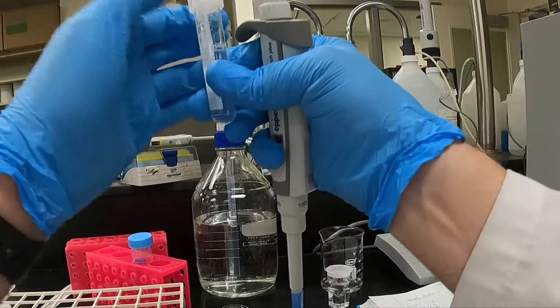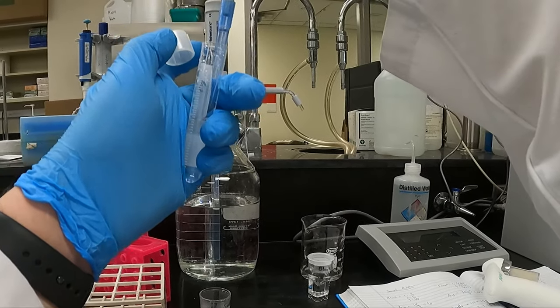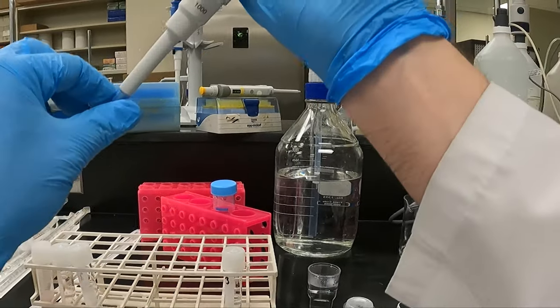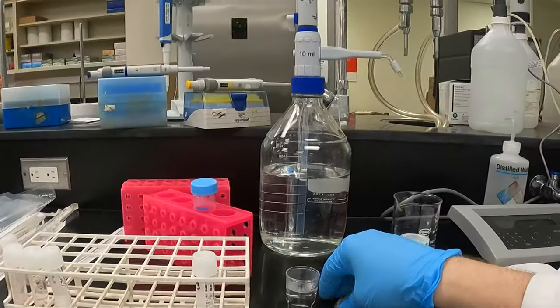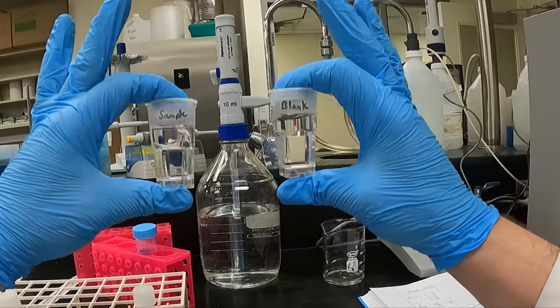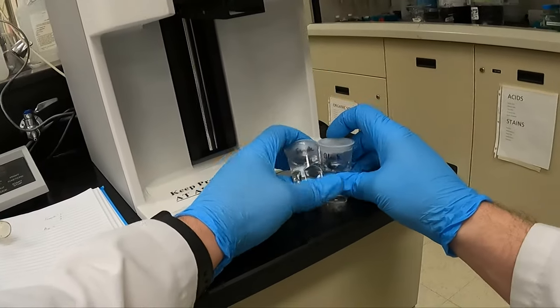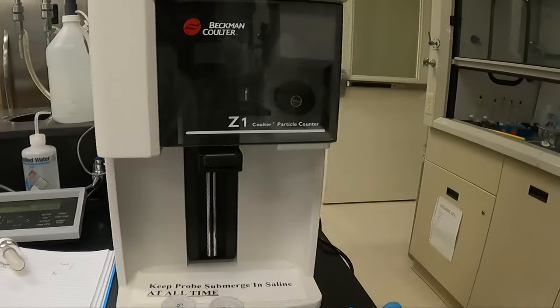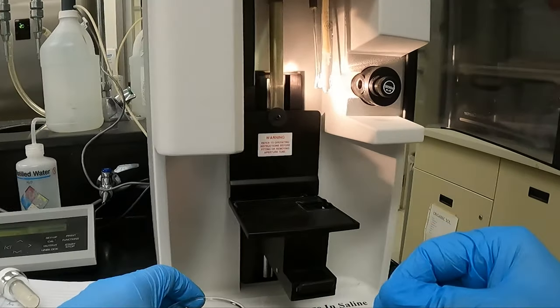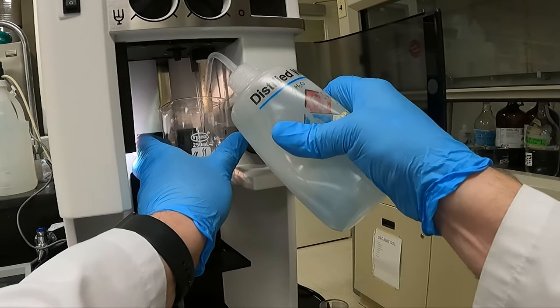Before I sample, I thoroughly mix it. Again, I'm taking 1 mil this time. Why? Because this is a very dilute solution. We have our sample, we have our blank. Let's now count them. What I'm shooting for is to be within 10% of my desired final concentration. As I stated, this is a very challenging dilution. I'll be surprised if I get below 10%.